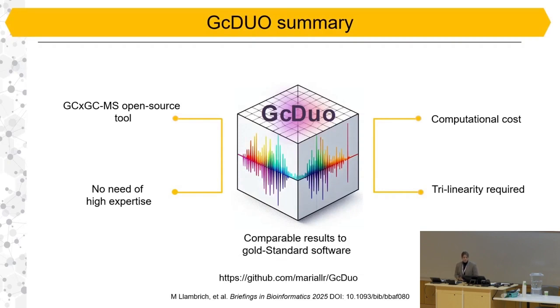So, as a wrap-up, GcDUO addresses the challenges of raw GC data analysis by providing a comprehensive suite of tools for processing, deconvolution, and interpretation. Implemented in R, the software operates through several key modules that each one can adapt as they need. It accepts non-vendor specific files and rearranges the data into 4-dimensional tensor structures, preserving the GC data integrity in every dataset. GcDUO uses advanced chemometric techniques, including parallel factor analysis and its variant PARAFAC2.